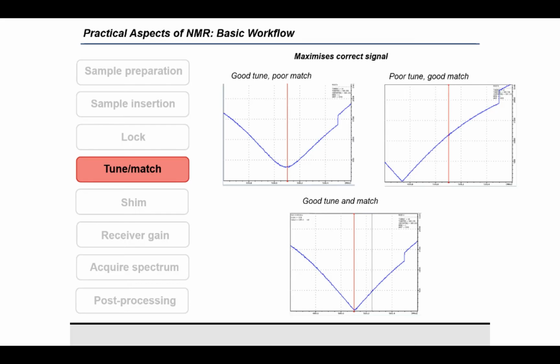And the reason we talk about both of these at the same time is because they're not actually independent of each other. So generally you need to adjust one and then adjust the other and then adjust one and adjust them both together until you've got it optimized.